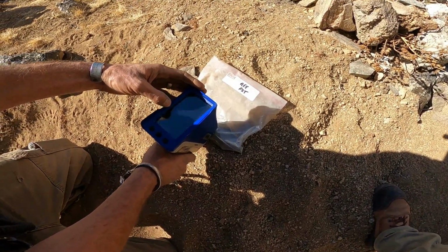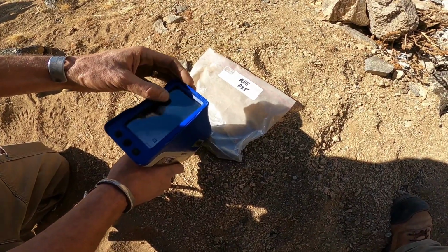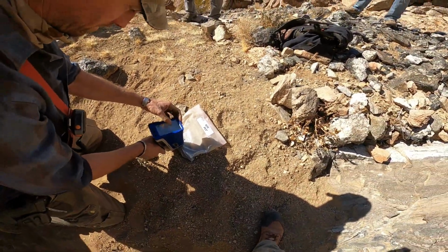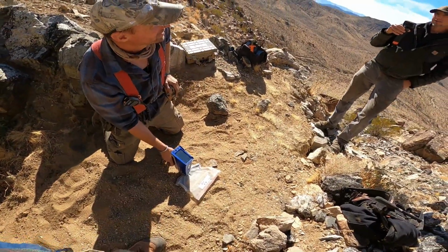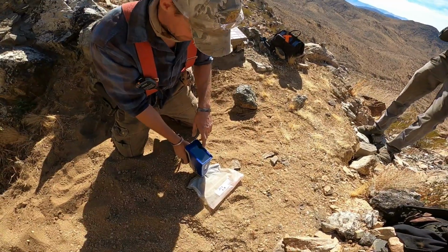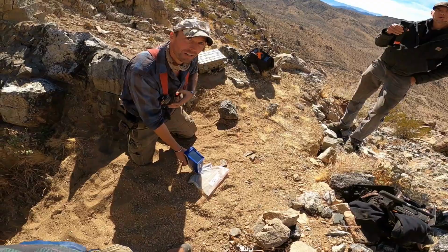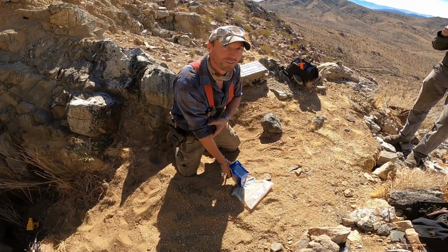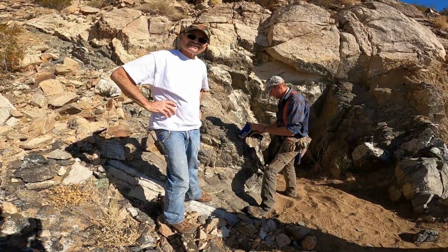Praseodymium. Sorry, no 432. Scandium. Sorry, bud. And if you get DY, let me know. Dysprosium. And then TE, right? Is that our thulium? 25 parts per million. You're getting silver too, huh? Yeah, but that's like crustal. That's not a big deal. That's 12. Yeah, I saw it was 10 before. If you see 1,000, then maybe give me a call. I'll come and take it from you. That's what he just did.